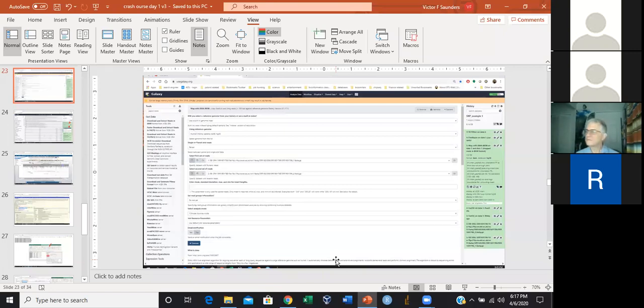So another question is, could you please explain the difference between coverage and depth? That is a very subtle problem. Coverage is where you look at a region of your sequence, and you look at the number of pieces of DNA, number of reads that are overlapping it. Depth is at a particular point.